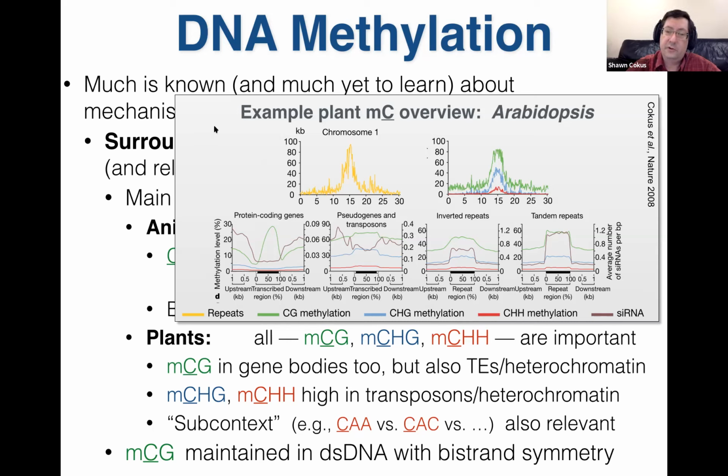So in terms of the whole genome overview, I'll get to the scale of an entire chromosome. Here's what a typical plant chromosome looks like. This is, again, Arabidopsis. We're looking at chromosome 1, where the centromere is in the middle, and Arabidopsis has its heterochromatin packed around its centromeres with fairly good boundaries between where that starts and stops. And the yellow is the repeat content, just dispersed repeat sequence similarity. That's not any kind of methylation assay. That's just in silico investigation of the sequence.